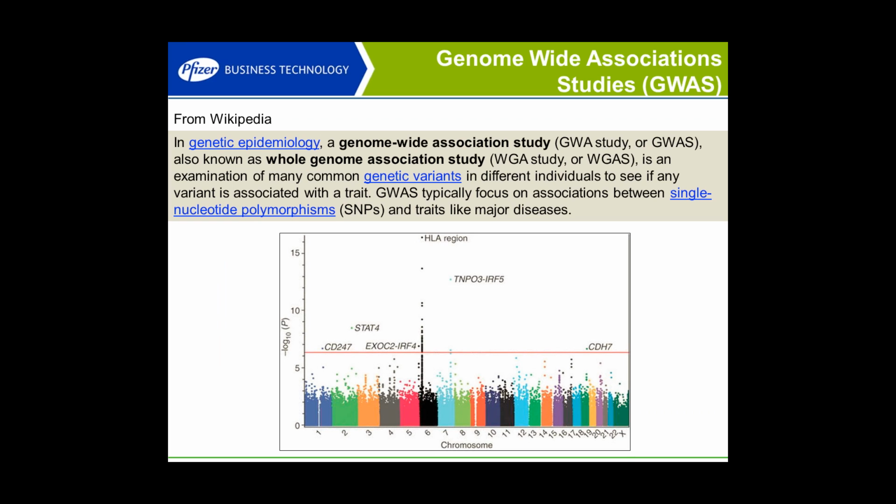Okay, so basically the thing that Pfizer added into tranSMART is support for genome-wide association studies. I'm sure that most of you on the call understand what these are, but fundamentally, I've got the definition from Wikipedia. Basically, they look for allelic differences between cohorts of subjects that exhibit a certain trait versus those who do not. For example, it could be a disease-related trait.